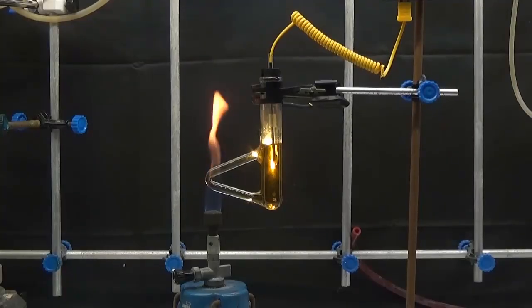Determine the melting point: 178 to 180 degrees Celsius.